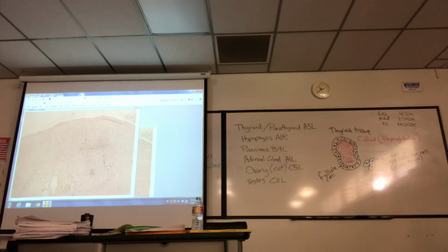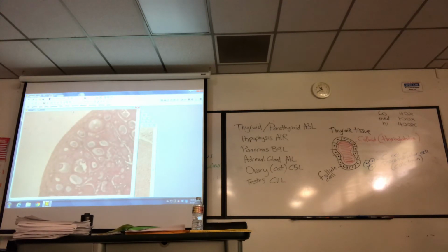Ovary. This is low mag. Let's go to 100x.